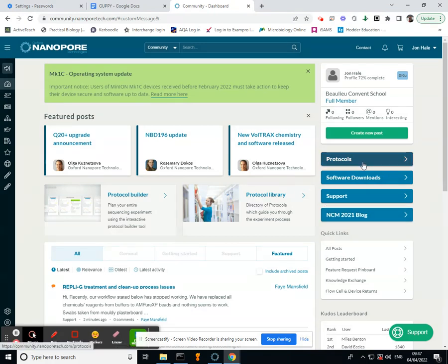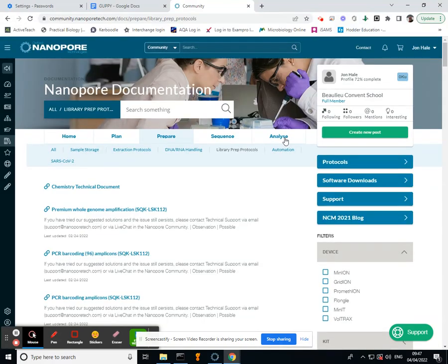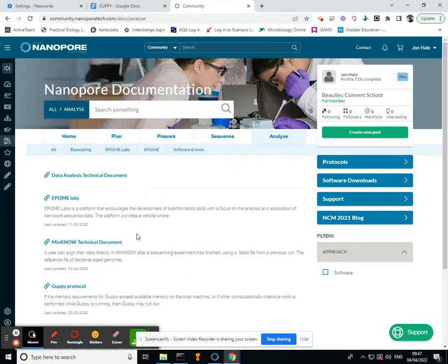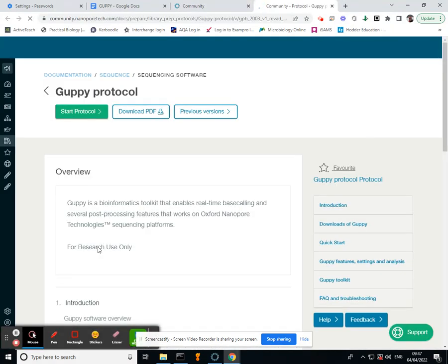If you go into Protocols, you can find Guppy in here. Please make sure that you have actually downloaded the most up-to-date Guppy, as it will be the most accurate when it comes to the base calling.